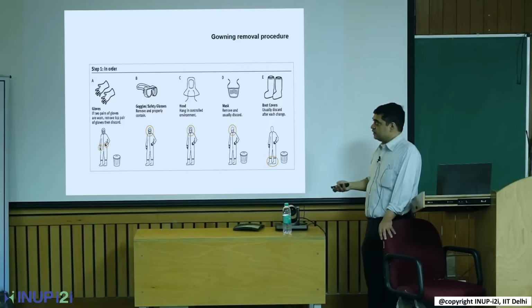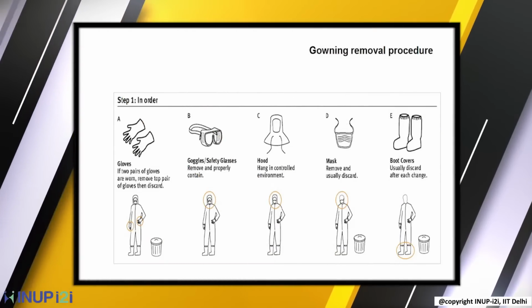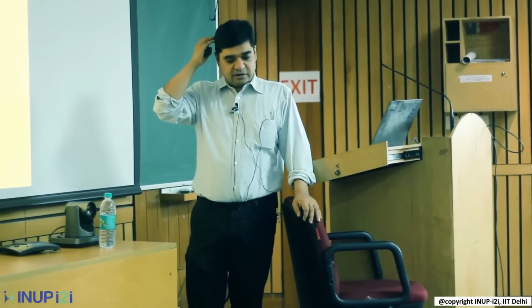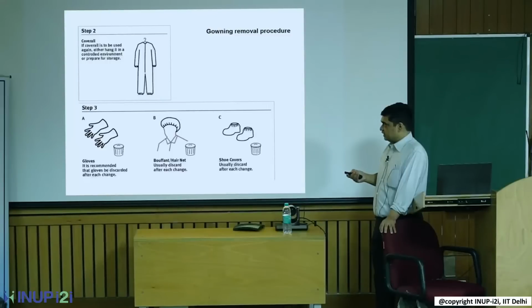So generally the order is reversed. In whatever order that you have worn it, you take it off in the reverse order. So that ensures that this problem is not there, right. This hairnet and gloves we throw away, but this coverall is reused.